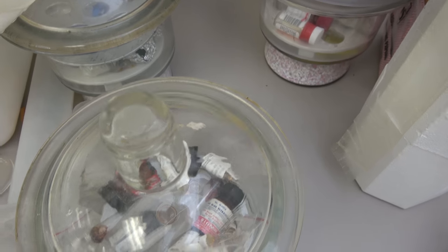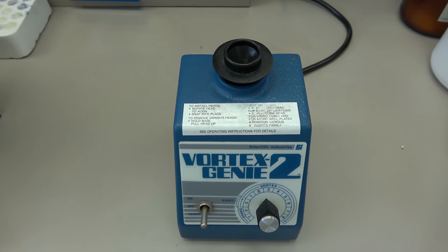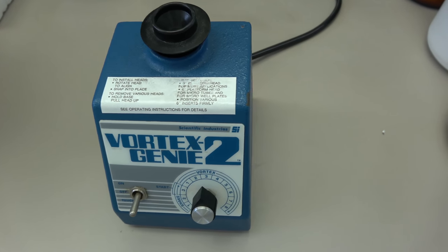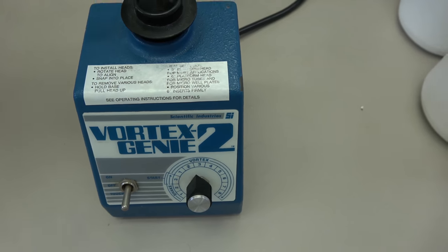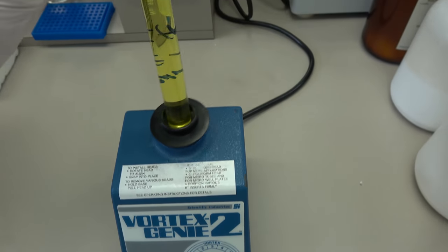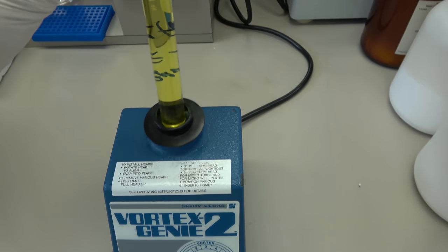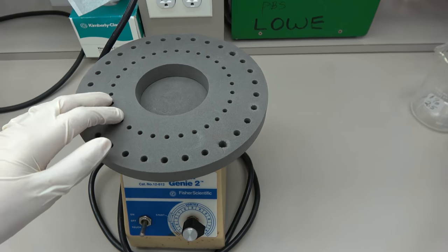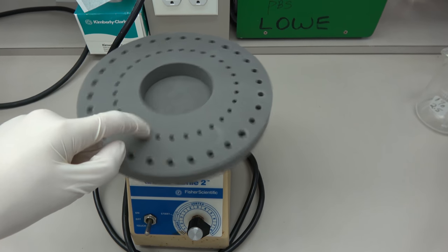If you see these weird doodads around. These are called desiccators. Long story short if you want to keep something dry you put it in here. Here we have a vortexer. This one's a vortex genie. So if you need to vortex something you just do that. Do some mixing. Someone put this here. But it's pretty fun to play with.